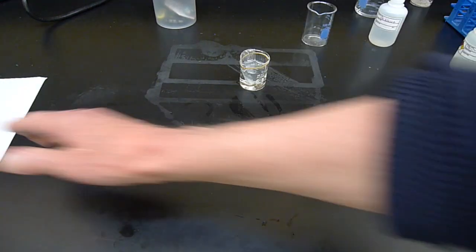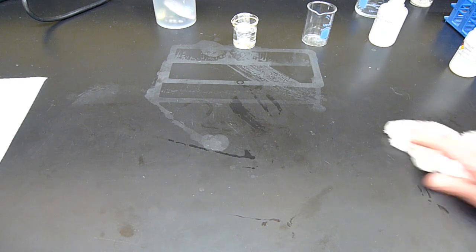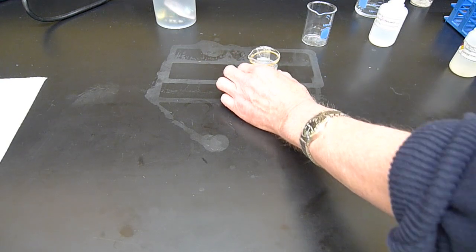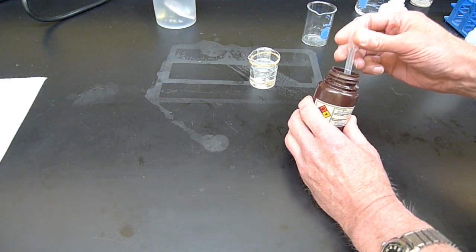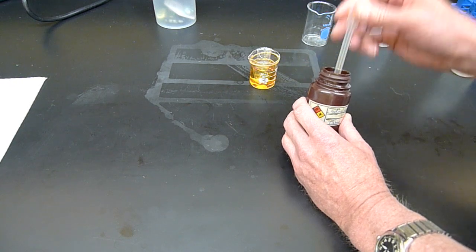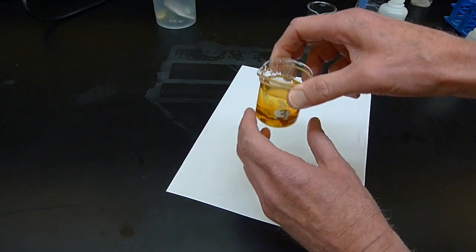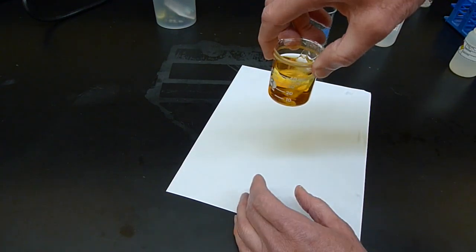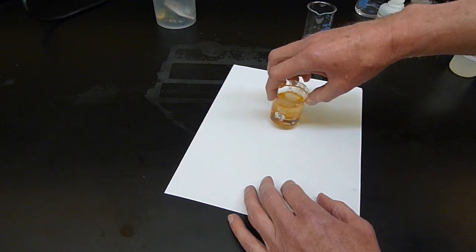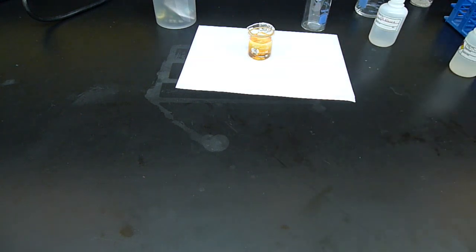In the meantime, let's record what this stuff looks like before diffusion. Oh, so the other thing I'm going to do is put in some iodine. I'm going to put some iodine into the beaker water so that it has that nice iodine color. So you can see here, it's got iodine in there. We'll see what happens with the iodine in the beaker too. But for the moment, I'm just going to record what the stuff looks like.